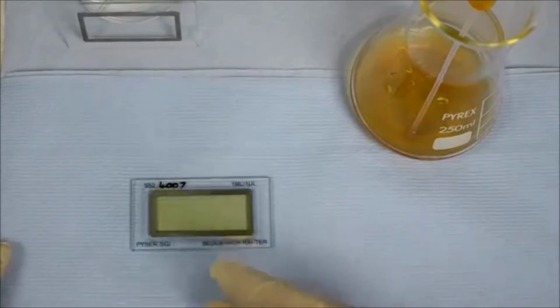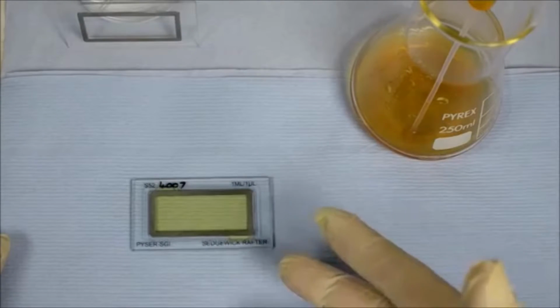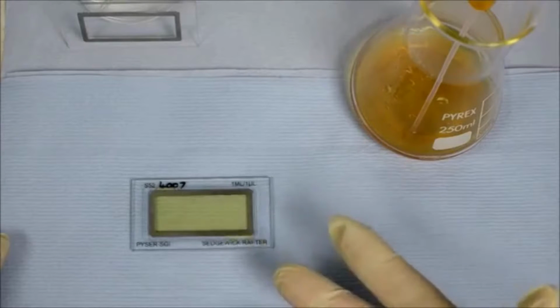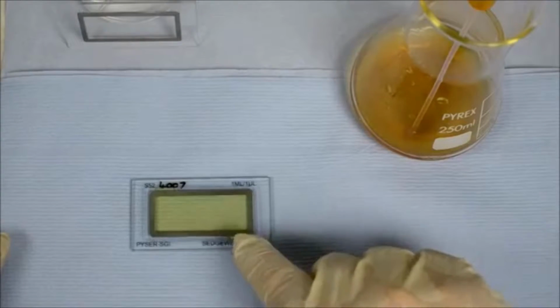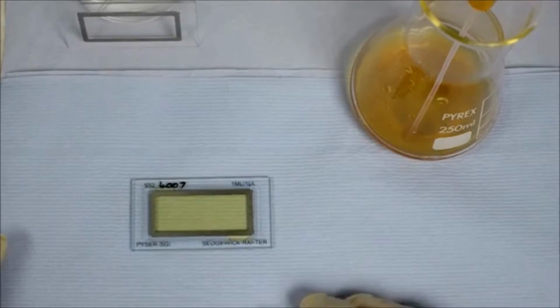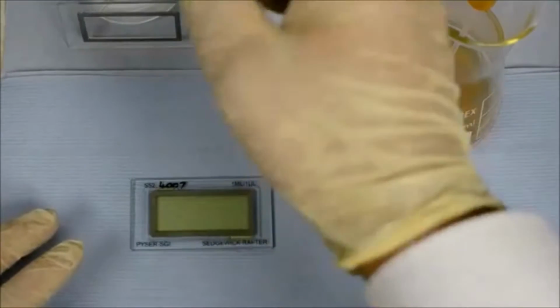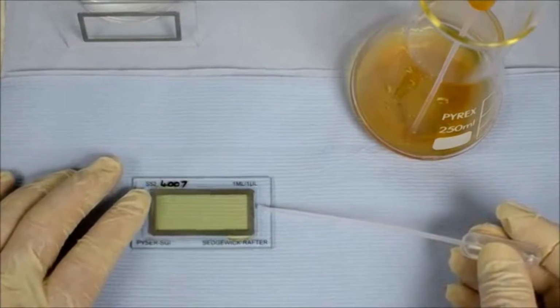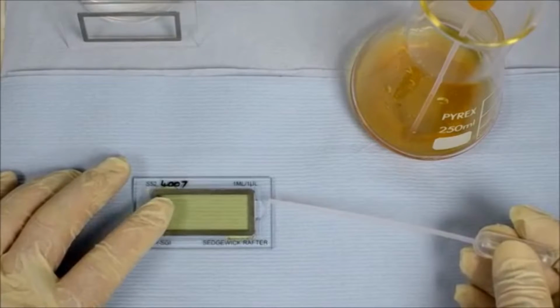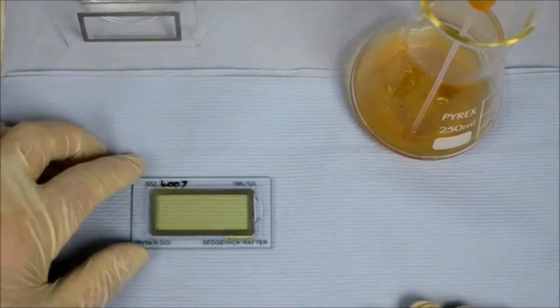Now, this can be left on a microscope or not. If you have a cool illuminated LED type microscope, it might be fine on the microscope, but if you're using a halogen illuminated microscope, it could get warm and could cause small air bubbles to appear underneath the actual cover glass due to evaporation. In fact, with a halogen microscope, this can happen even during the count. So to prevent bubbles forming, take a small drop of distilled water and just place it on the edge of the chamber, a small drip against the side wall here like this, and that will prevent bubbles forming during the actual evaporation of the sample away.